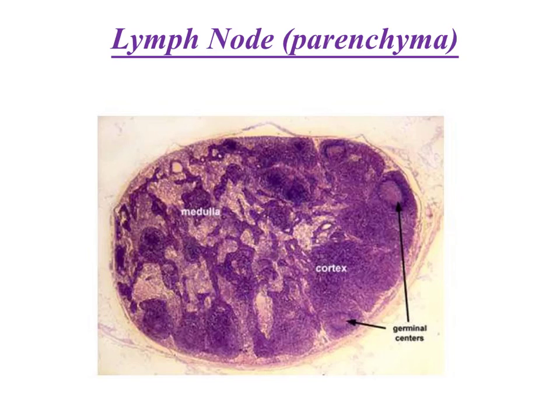In this picture you have also the capsule present on the surface. You can see the capsule. You can see trabeculae, but you cannot see reticular formation because it is only stained with silver. So in this picture you have this label for this structure like this.